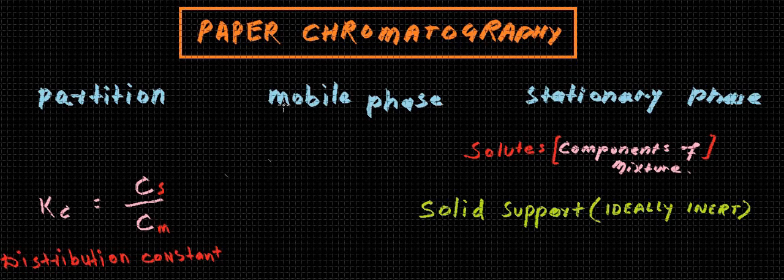Dear students, in this very short video, we will start paper chromatography. It's a separation technique and it's a type of partition chromatography where we have two phases, a mobile phase and a stationary phase.